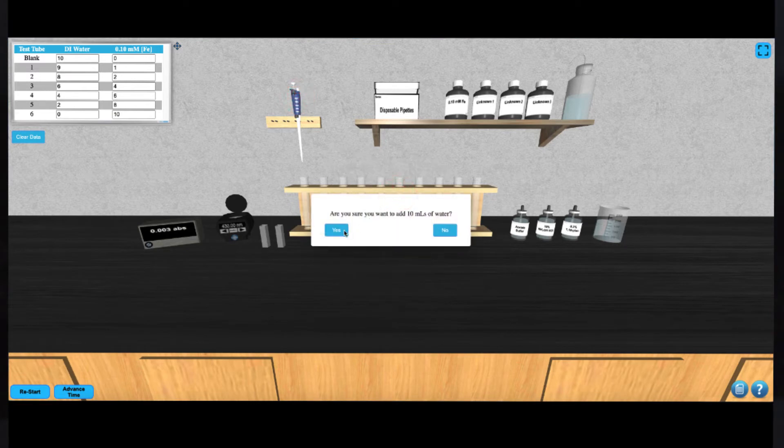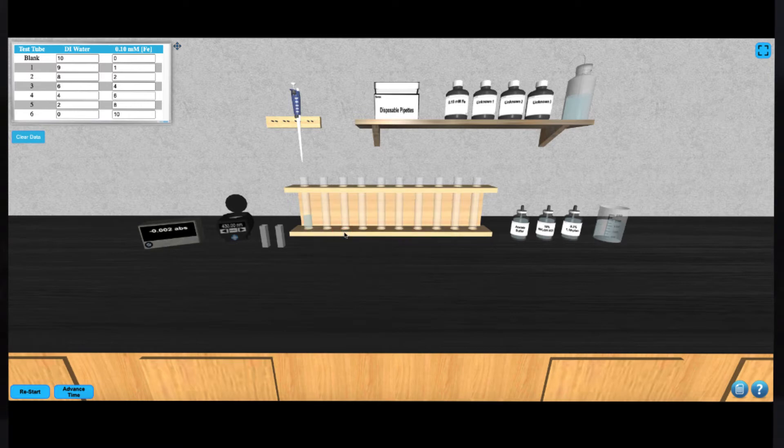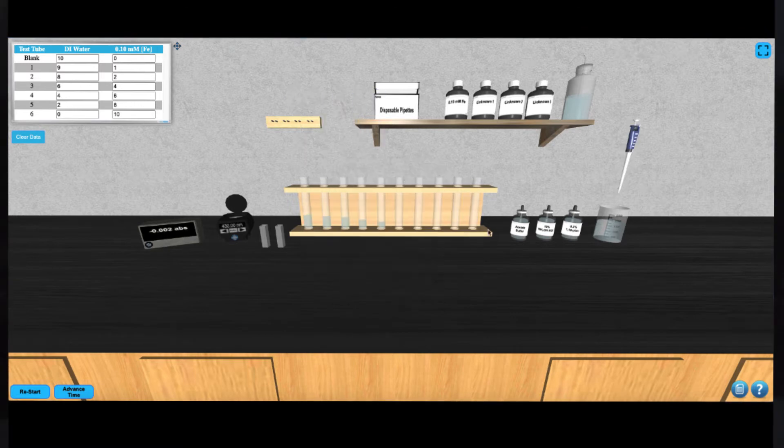Continue in this fashion until you've dispensed all of the appropriate amounts of the water and iron solution.